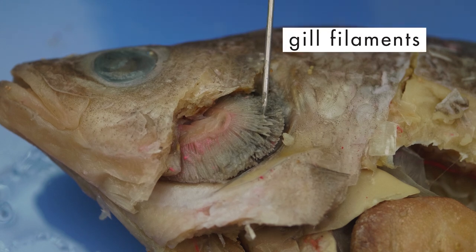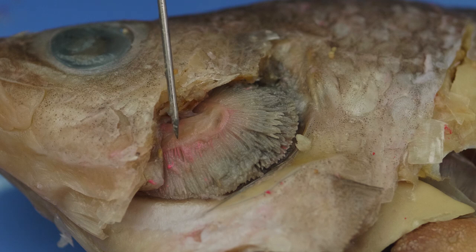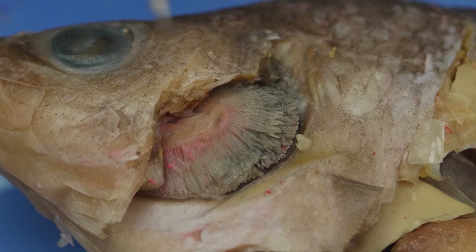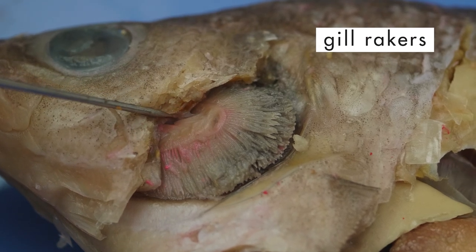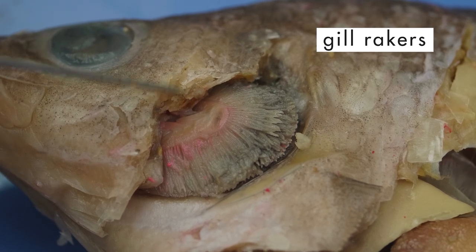Gill filaments contain thin membranes that allow oxygen from the water to pass through them into the gill capillaries and into the blood. Carbon dioxide from the fish's blood is released from the gill capillaries through the gill filaments and into the water. Each gill is supported by a curved bone called a gill arch. Extending from each gill arch is a set of bony projections called gill rakers. Gill rakers trap particles in the water that might damage the gills.